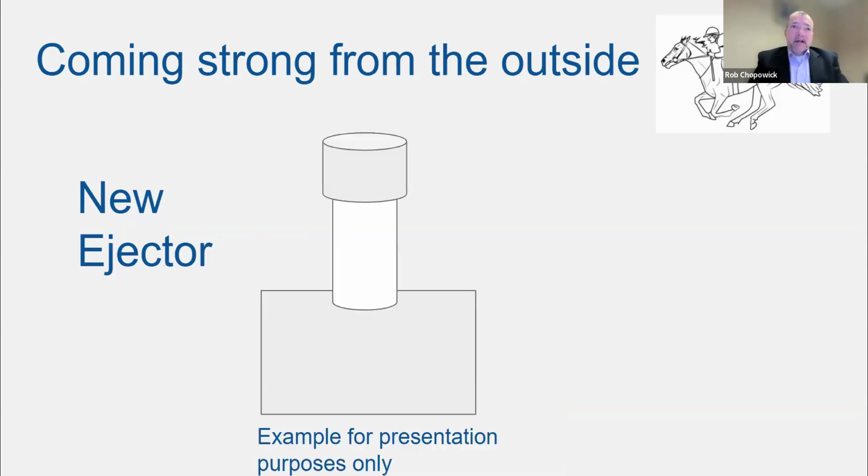I'll talk about that risk in a little bit, but the other thing that came along with the propylene gas was a new ejector. Now, this isn't how it looks. I was going to put it in, but I realized I'm not sure about patents and patent pending trademarks on the new design. Some of you may have seen it, I don't know, but basically it is a new device that is ideally going to work with anything that we have, whether it's IPA, propylene, or even SF6. It would replace the whole ejector. So my apologies for not having that new design to show you. But again, with trademark issues and the people designing it, I want to respect their right for that.